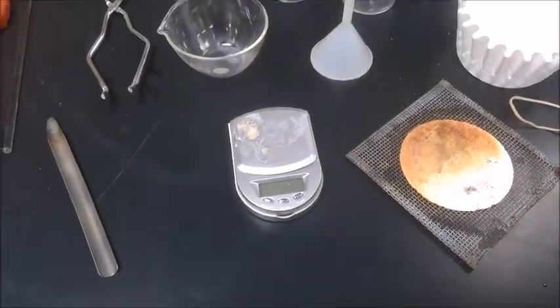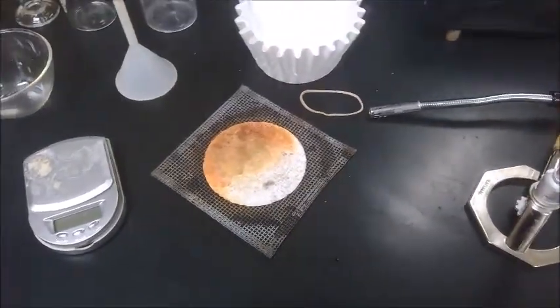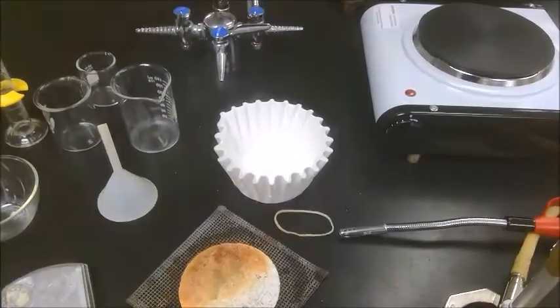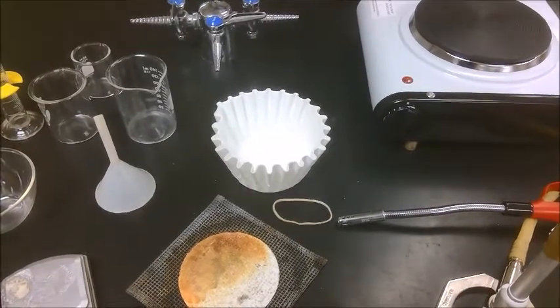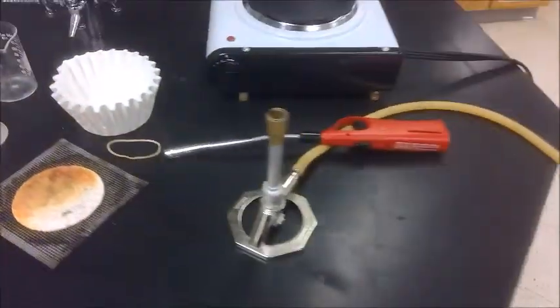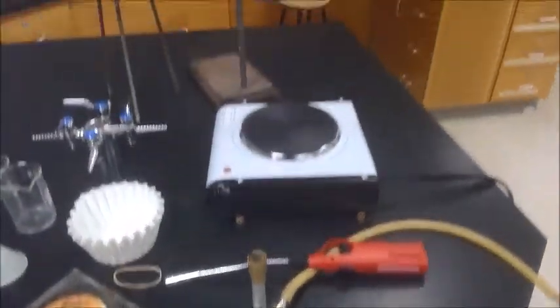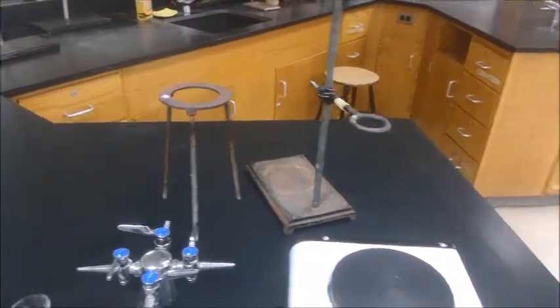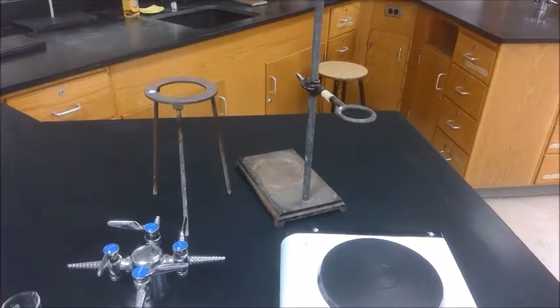...a digital scale, a wire mesh which can be used as a heating stand, coffee filters and rubber bands, and then if you need to heat stuff we have Bunsen burner and a lighter, a hot plate, and we have a metal tripod or a ring stand with an iron ring.